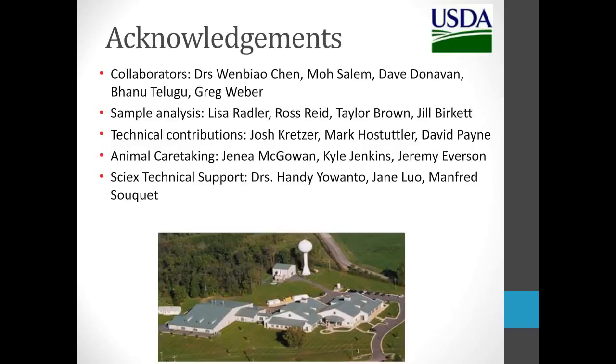Okay, looks like we have time for one last question. That question asks, what delivery mechanism do you use for CRISPR mutagenesis, and at which stage do you induce the mutation? So because rainbow trout eggs are 3 millimeters or so, we can use a dissecting microscope and a syringe, and if you have a steady hand, which I do not, you can deliver the genetic material straight into the egg.